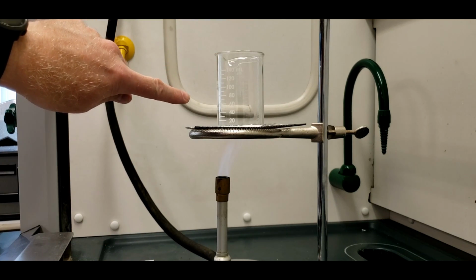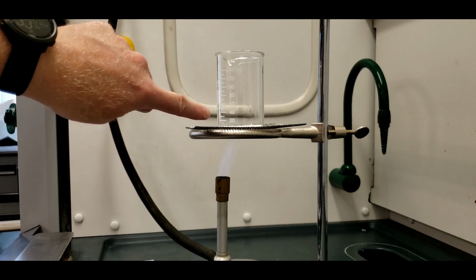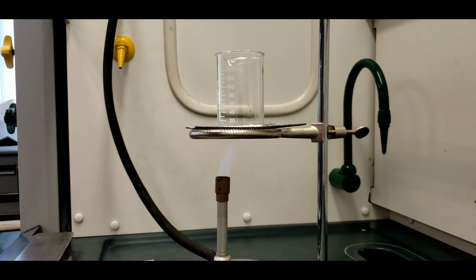The beaker's ready here. Nothing has happened yet, but we should start to see the fuming of the ammonium chloride as it sublimates. Let's see if that will happen here. If not, we'll pause. You can also see I have the flame off to the side because the fume hood is pulling on it. Oh, there we go. You can see that now.